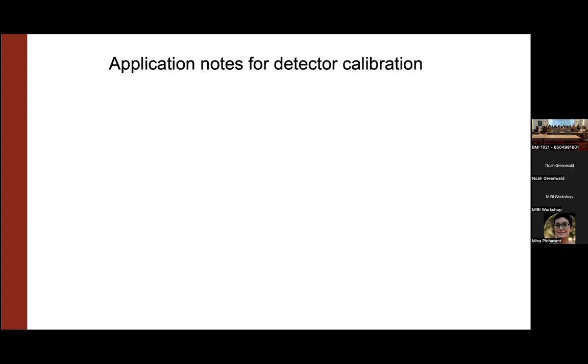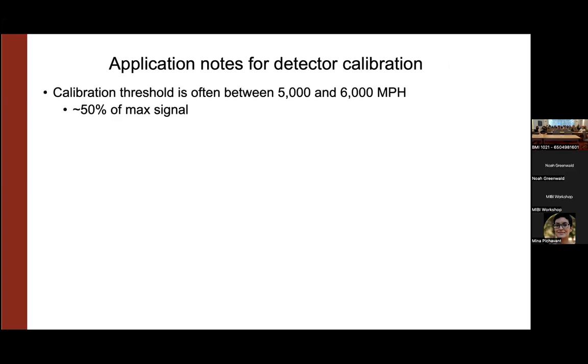So this is good because it allows us to say, okay, here's where the MPH is at this given time, and therefore with the tuning curve, here's where our sensitivity is. But it doesn't tell you how low is too low. How do you actually know when it's time to tune the detector? So what we've found, and this is another thing where, with our two instruments, we have a range that we think is pretty solid, but as more people start using it, we will probably narrow in on what the appropriate range is for many of the different MIBI sites.